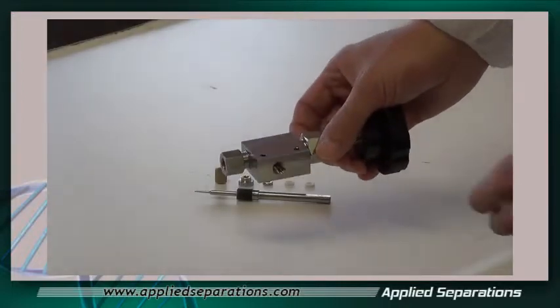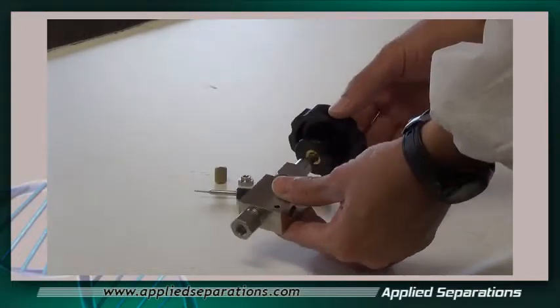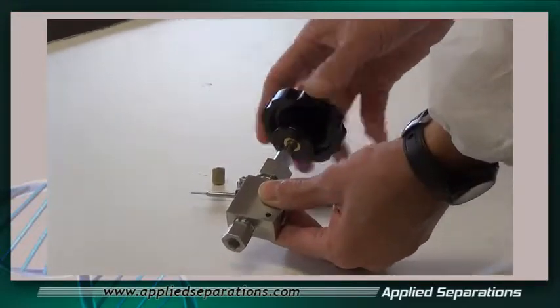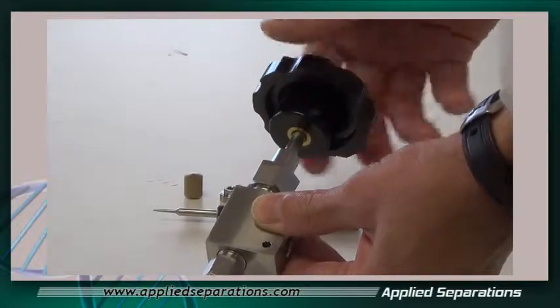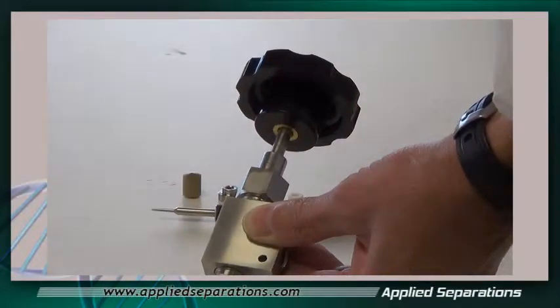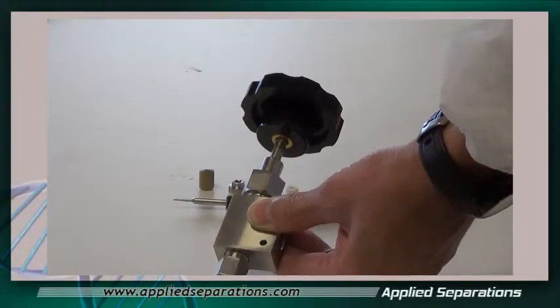This is a micrometering valve. You want to make sure that the valve is all the way opened, so you want to turn the knob counter-clockwise and open it up all the way until it doesn't open anymore.